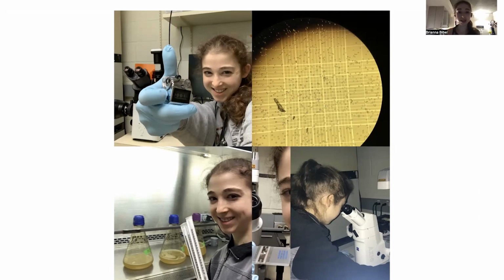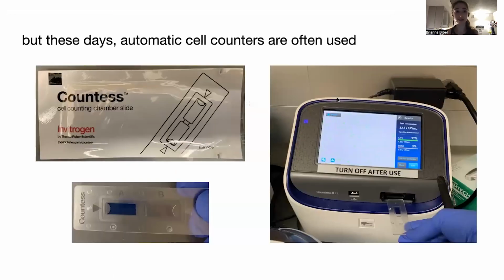I really hate using these things. This is me in grad school with SF9 cells, so these are insect cells. But this is just an idea of what these things look like.